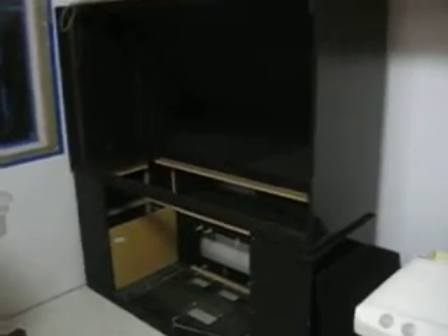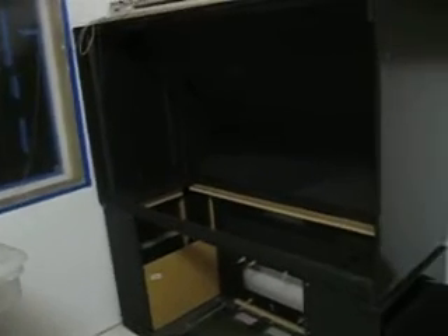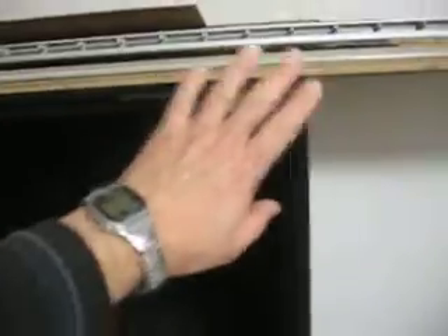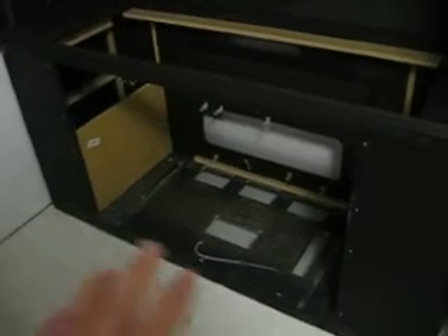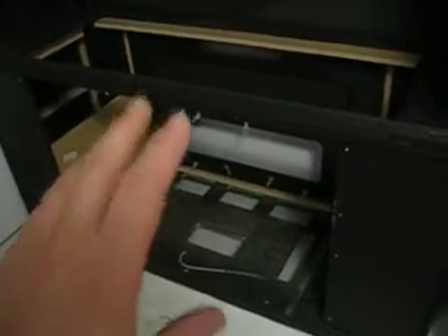I'm converting an old big screen TV into a laminar flow hood of sorts. I took the screen off of the top half, I took the guts out of the bottom, and I actually had to turn the top half — the top half lifts off the bottom half, and I turned it around because this side of the unit is open enough that I can get at it.